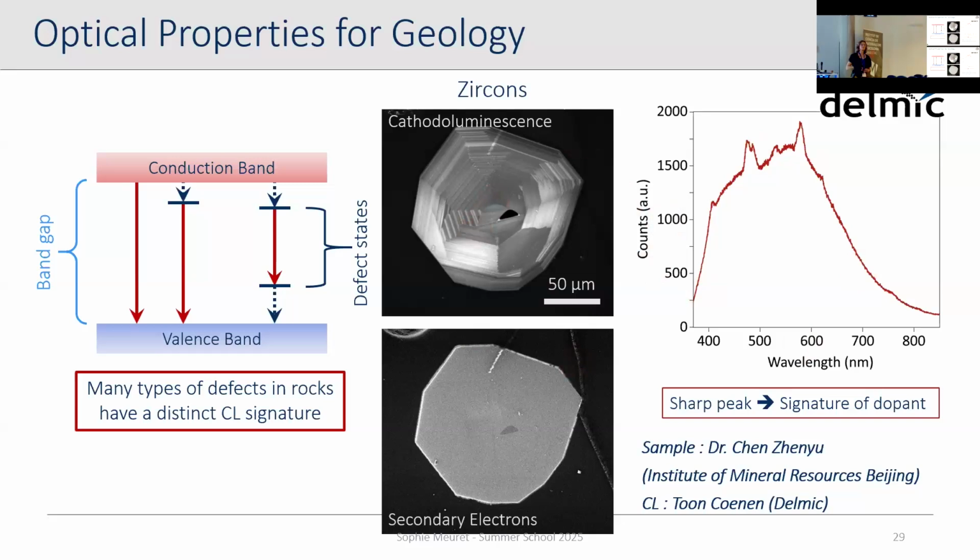They basically didn't need a really good microscope. They were doing this in an SEM. Because the sample is so thick, it's super, super bright. So you don't really need a high collection efficiency, all of those things. You really don't care. So they were the only ones using it. That's why usually when you say to people that you're doing cathodoluminescence, they say, oh, these old techniques are just for geology. But of course, it changed.